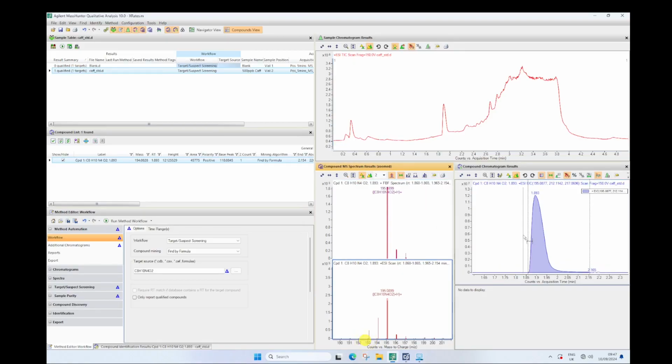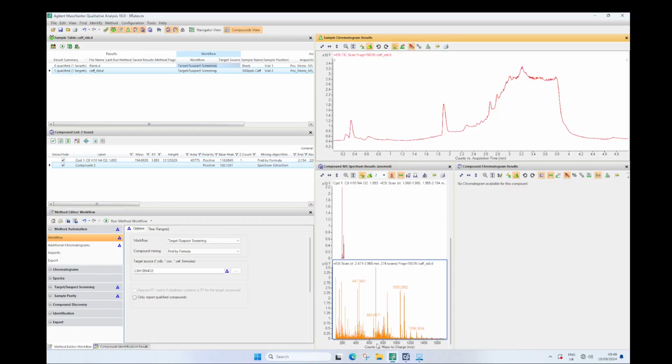The other thing we need to evaluate is the peak shape. Here you can see some tailing, and there might be some benefits in adding the acid, the acidic mobile phase versus just the unbuffered one. At the moment I'm getting a lot of background from my TIC as well. I could investigate that by using a range select tool, double clicking and just getting a feeling for some of these high masses, what's floating around in the system. And it could be that the system needs a good flush and decontamination at this stage.